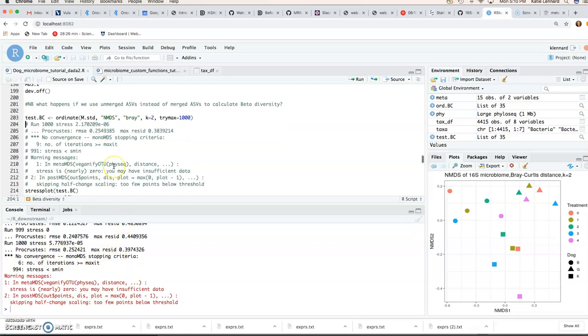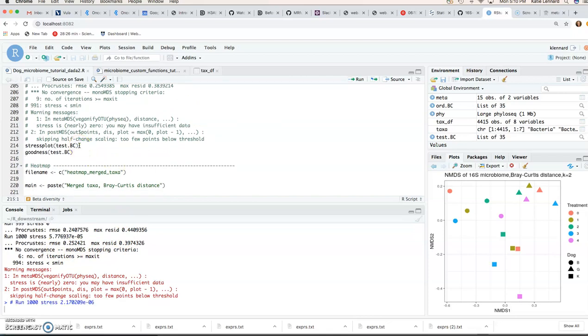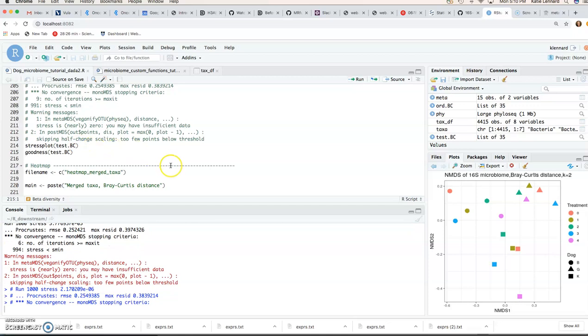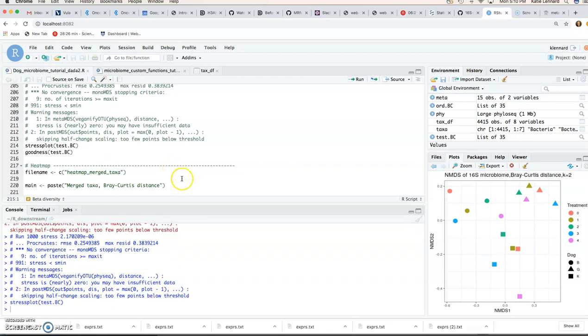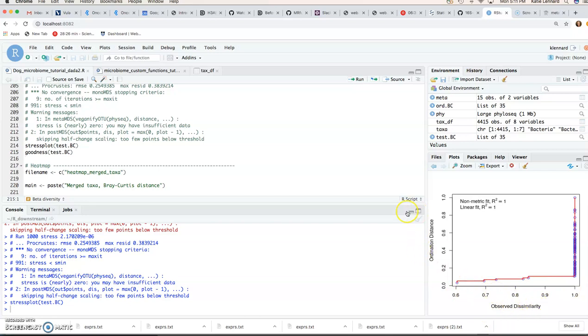So here if you look at the stress plot, just to show an example of what a stress plot shouldn't look like. So here we've got this kind of artifact effect where we see there's not a good relationship between our observed dissimilarity and our actual ordination distance.